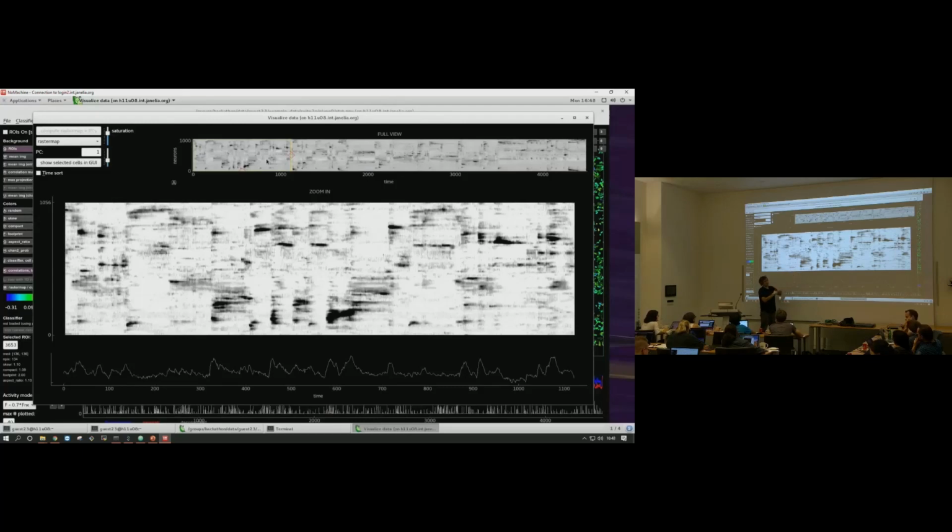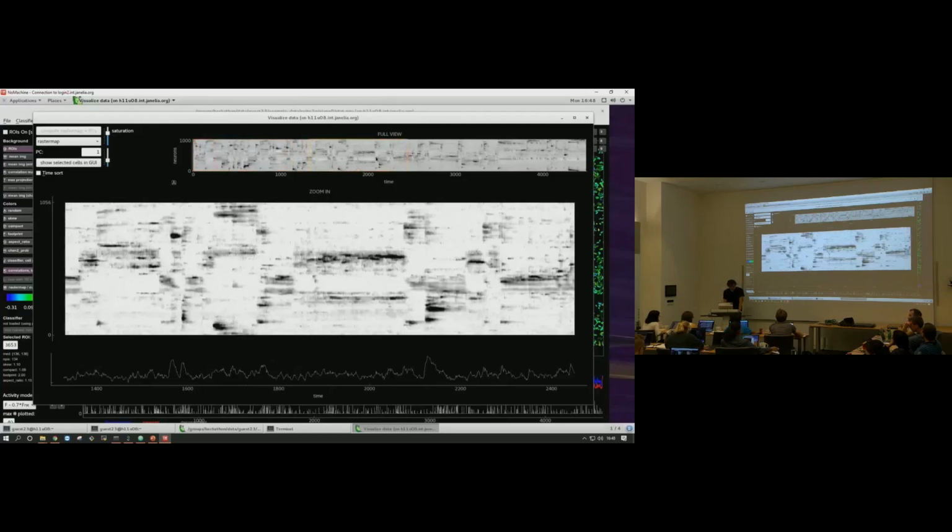So if we had started some imaging, we'd see at some time point a different set of patterns would emerge because of the stimuli, or because of the behaviors or whatever the mice are doing. And so it would give us a sense of which neurons activated in response to what epochs of the experiment. Okay, and we call this a visualization tool.